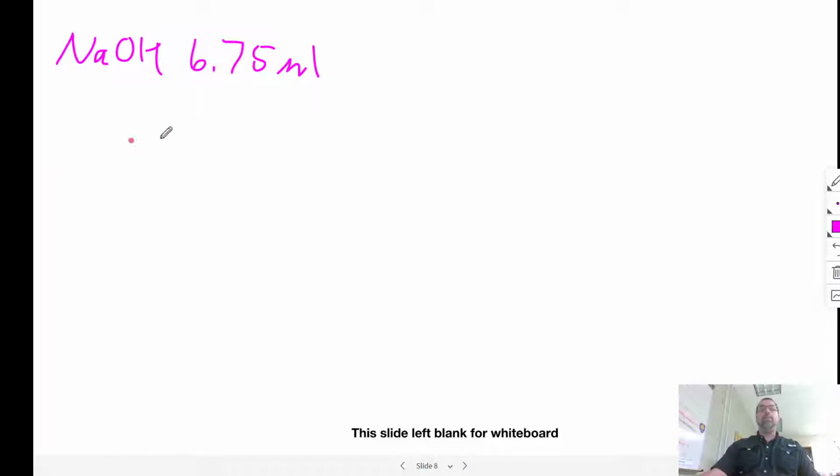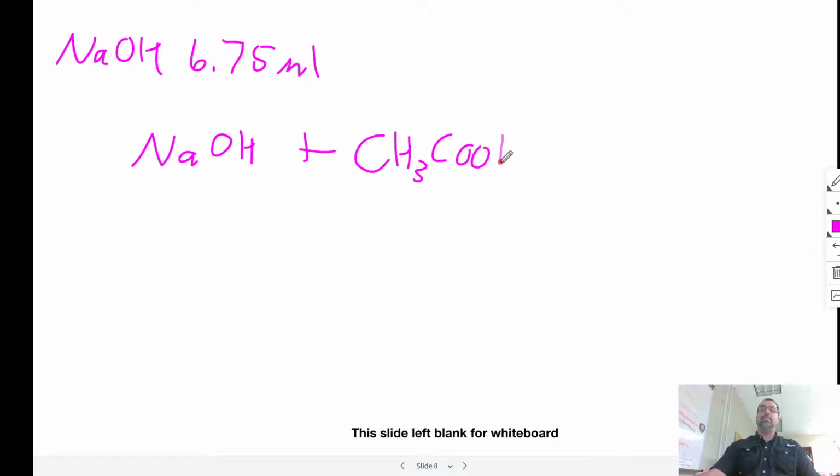Well, we know that 1 mole of NaOH combines with 1 mole of acetic acid, and that's going to go ahead and make sodium acetate and water. Okay?